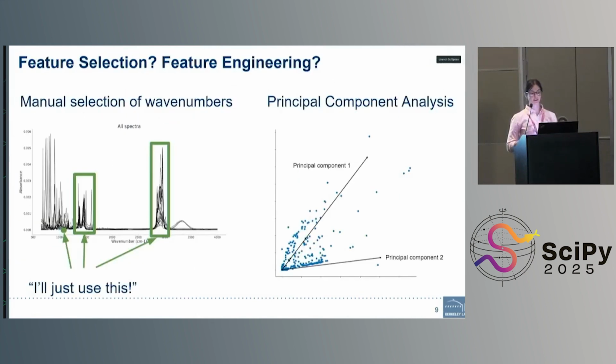And the next step was figuring out how to turn the clean spectra into interpretable features and trim the dimensionality of our data, since one spectrum is represented by a 4,000 dimensional vector. Now, traditionally, researchers have tackled this by selecting specific regions of the spectrum that they know correspond to certain functional groups that they like, and then discarding the rest and only training machine learning models on those regions.